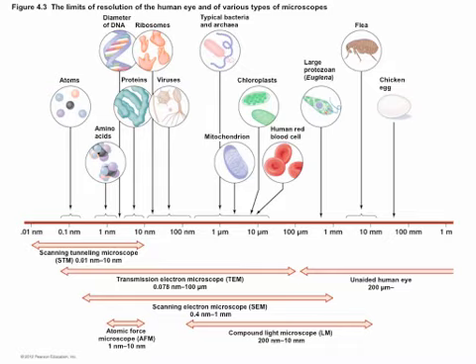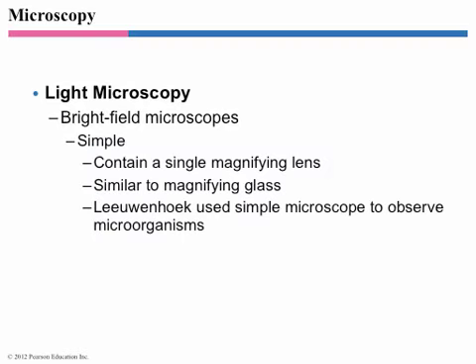So light microscopy breaks down into a few different types. There's bright field. This is what most of you are familiar with. You're looking at a bright field with a dark sample. You're not actually looking at the sample exactly. What you're looking at is the sample's shadow. You're shining light up at your eyes, and when it passes through the sample, it casts a shadow. And what you see is that shadow. So it depends upon the ability of your sample to block out some of the light.